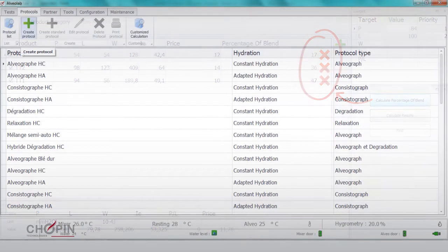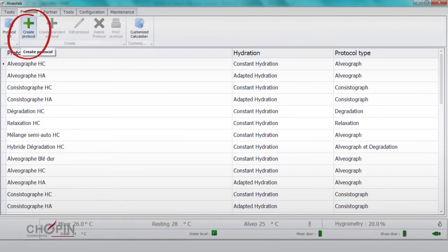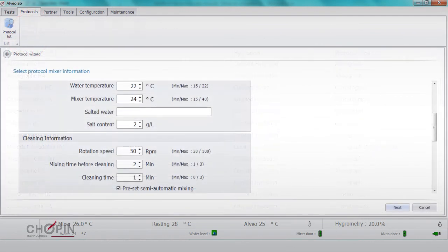Additionally, customized testing protocols can be developed by varying for example the intensity and duration of mixing.